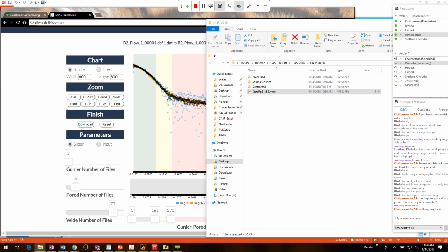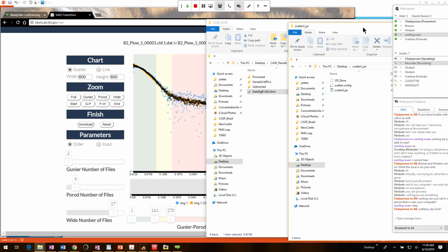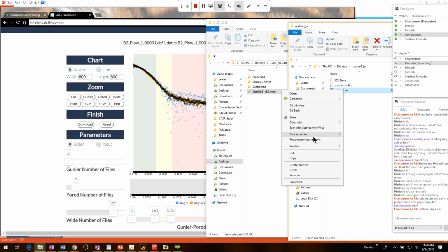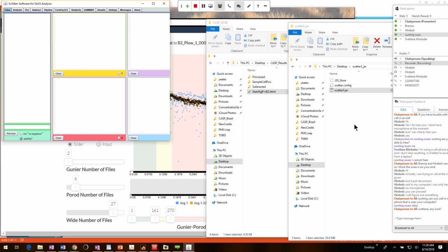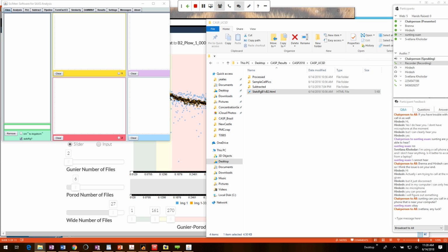Desktop. And I've done it sort of Martha Stewart style, where I've gone through this sample and done this for the whole data set. So if you don't have scatter, it's freely available. I have to make sure I open it with Java, and it wants the latest Java. So if you have trouble opening it, it's probably because your Java is out of date.